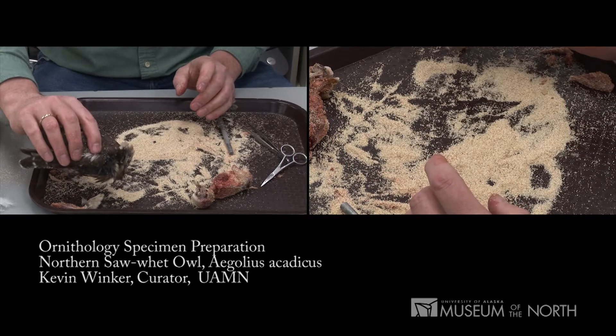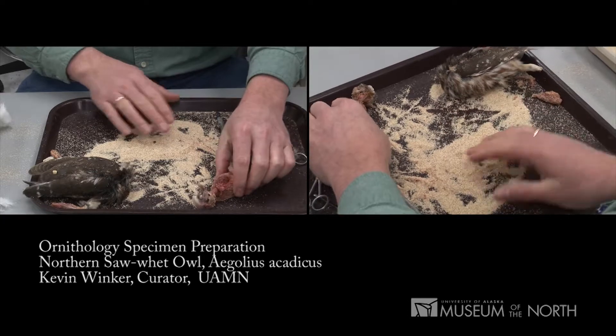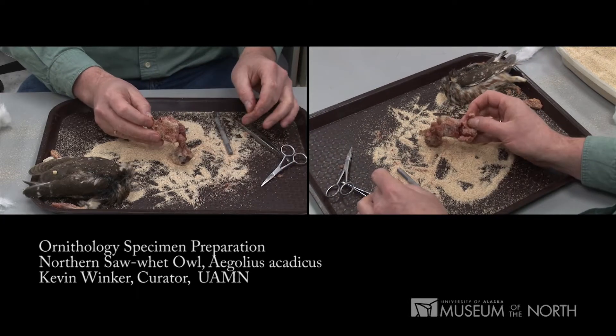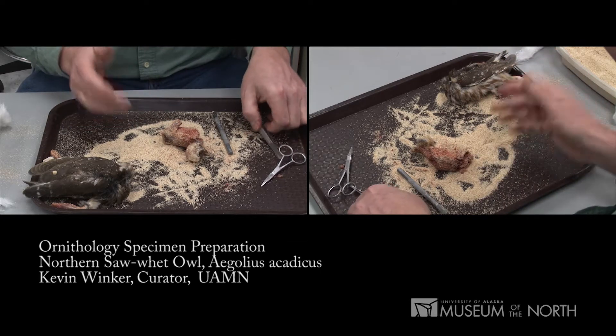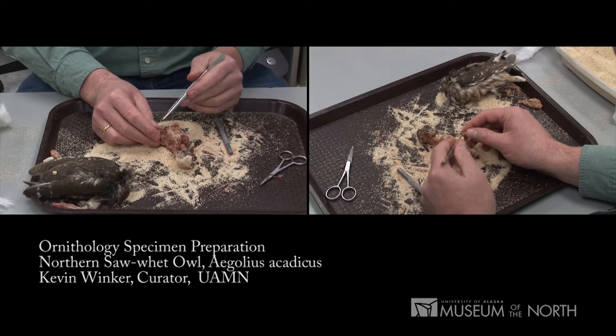Right now, while the tissues are still cool — indeed they're still cold on this bird — I'm going to take a genetic sample from the carcass and get those into the freezer so the tissue quality remains high. First, however, I'm going to sex the bird.